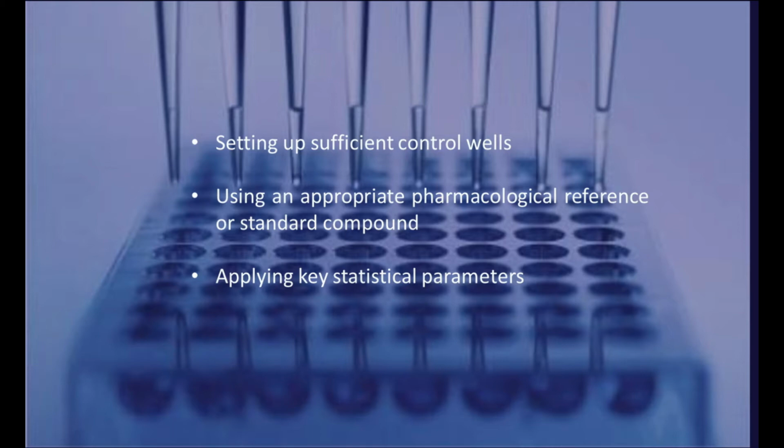Applying key statistical parameters. Statistics are an important tool to determine whether the compounds you test have a significant effect when compared to the controls. Several parameters need to be considered.